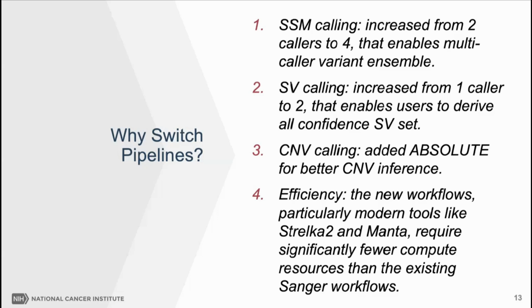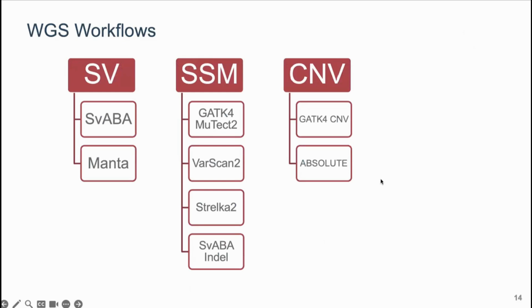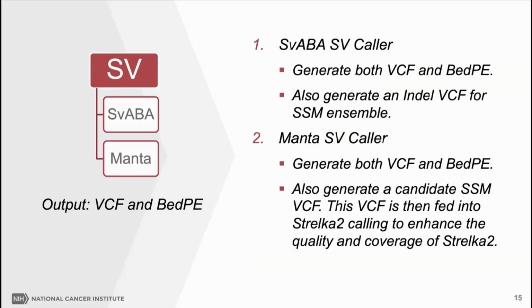So those are the main reasons we are doing this major whole genome variant calling pipeline revamp. Next slide. Okay, I will cover individual pipelines from structural variant calling to SSM calling, and finally I will touch on the copy number calling. Next slide.